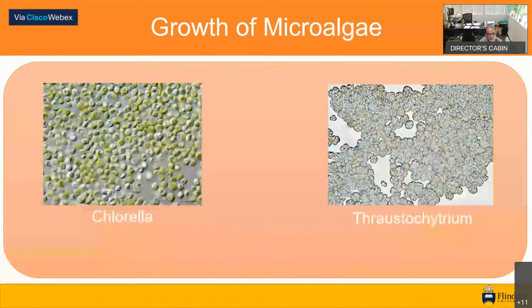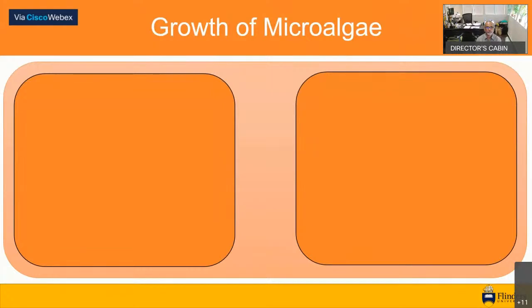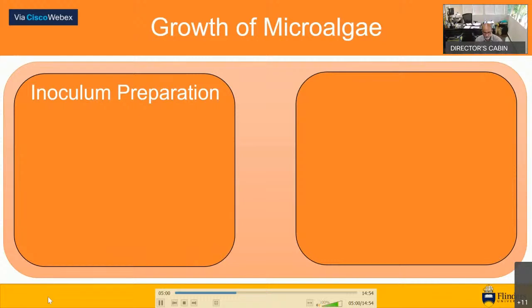The aim of the culturing process is to accumulate a large volume of biomass with a high proportion of intracellular lipid. Popular microalgae frequently used for lipid extraction include Chlorella, Haematococcus, and Scenedesmus. At Flinders, we utilise various strains of thraustochytrids due to their exceptional lipid content and high proportion of omega-3 fatty acids. These microalgae can be grown in smaller volumes in Erlenmeyer flasks or greater volumes of industrial significance using a bioreactor. The minimum growth time of a microalgal culture is 7 days, of which 2 days should be allocated for generation of an inoculum and at least 5 further days for development of biomass in the main culture.